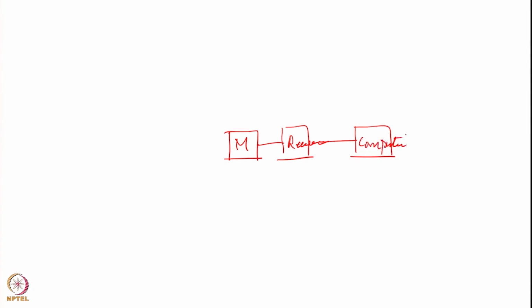Why do you need the computer? Because now you require extremely high time controlling, and then this is connected to a pulse programmer, because you have to apply 10 microsecond pulse or 2 microsecond pulse and so on and so forth.